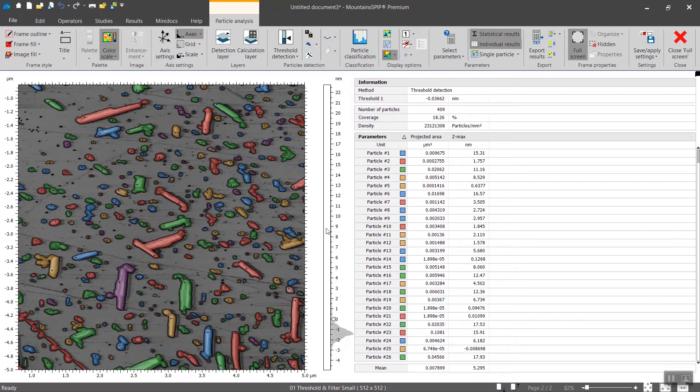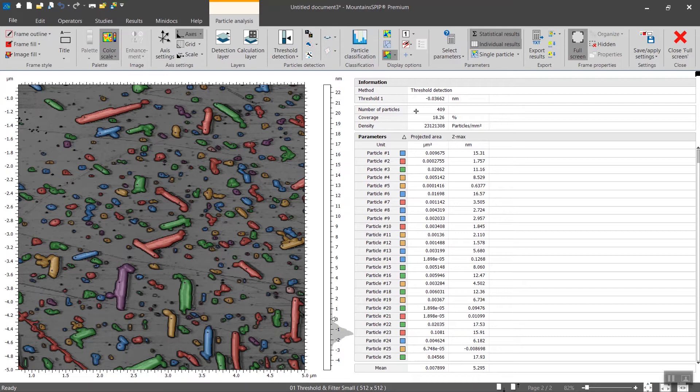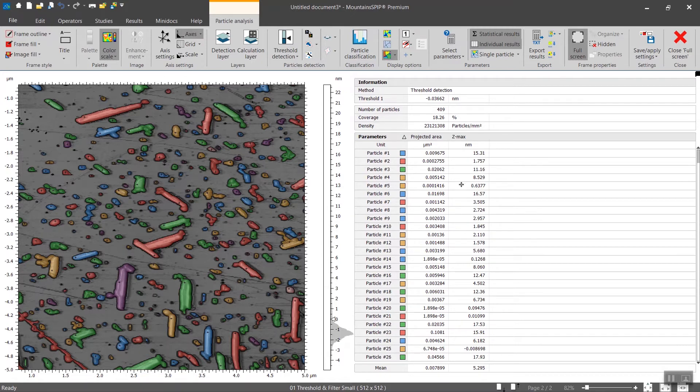On the right, the table has three main components. The first one is the information where you will find what method of detection was used, what was the threshold level in this case, number of particles, percentage of coverage, then the list of particles detected, and a number of parameters that are calculated.